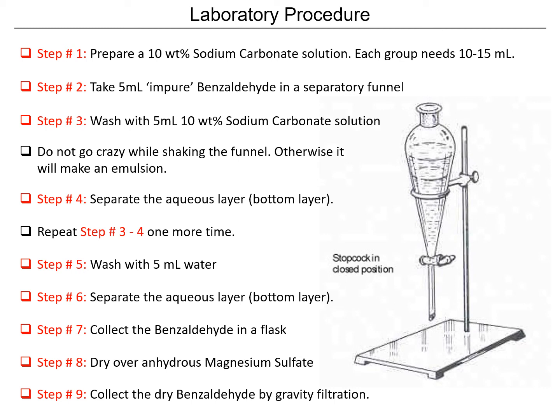Then wash with 5 ml of water and separate the aqueous layer, which is now the bottom layer. Collect the benzaldehyde in a flask and dry it over anhydrous magnesium sulfate. Collect the dry benzaldehyde by gravity filtration.